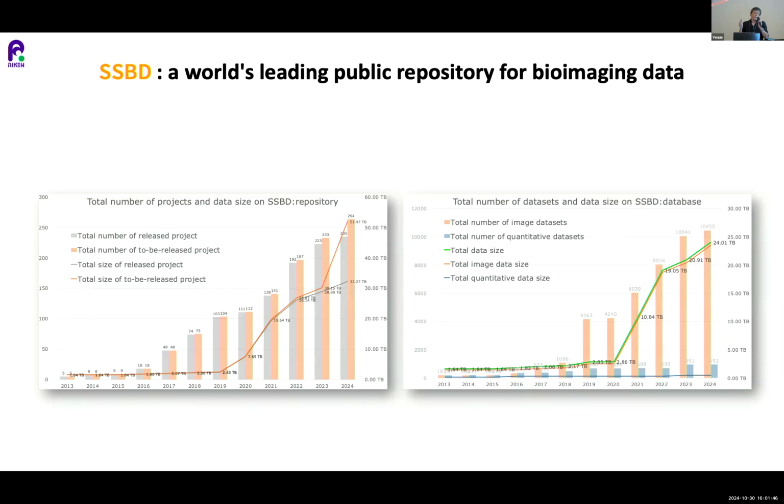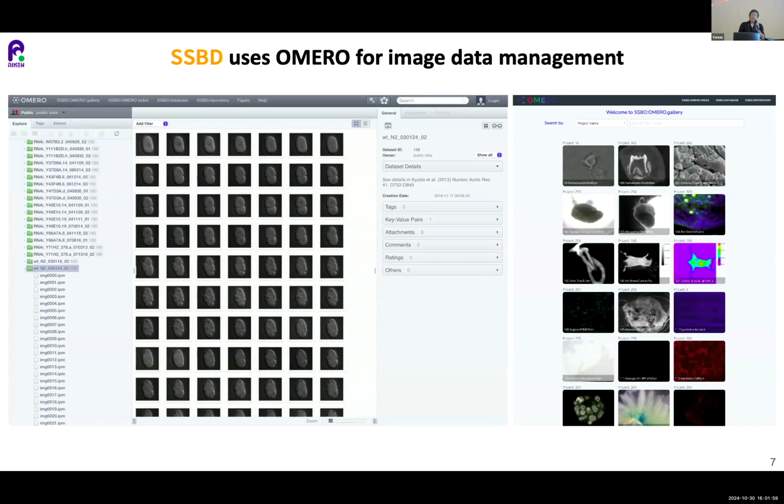Thanks to those activities, our database is one of the leading public repositories for imaging data. A bit deeper inside the SSBD, our database uses the OMERO system for data management and visualization.